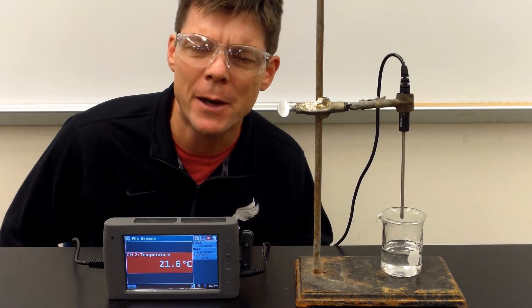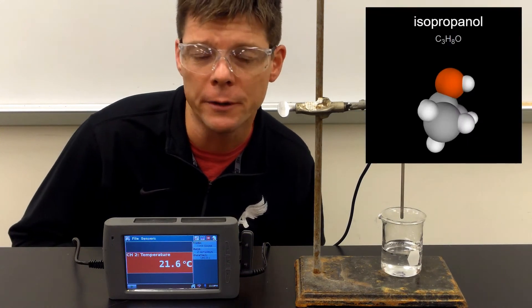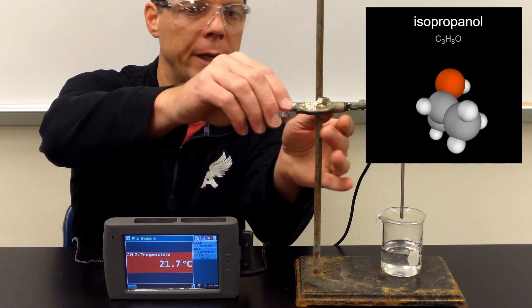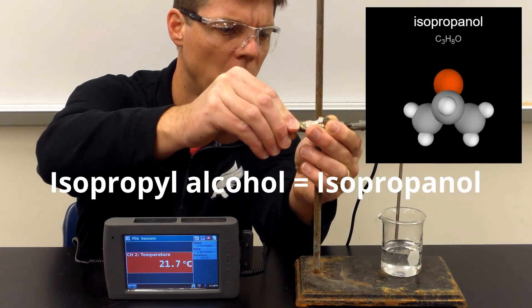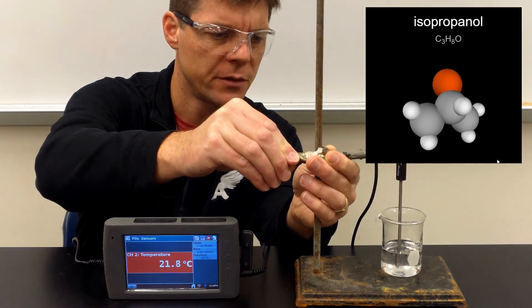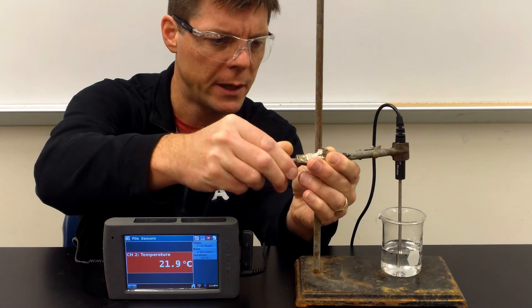Alright, so we saw the amount of evaporative cooling that took place with water. Let's look at the alcohol. I'll go ahead and lower the probe back into the liquid here. Again, this is 70% isopropyl alcohol, 70% rubbing alcohol. So just lower the probe in there like that.